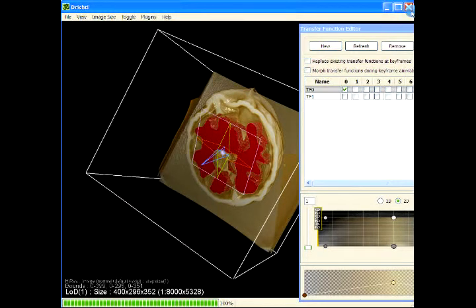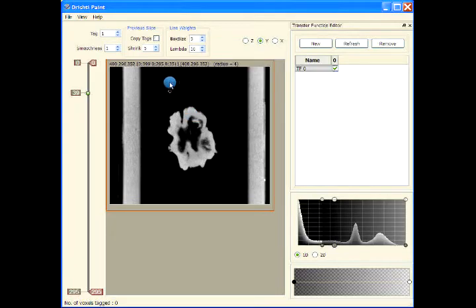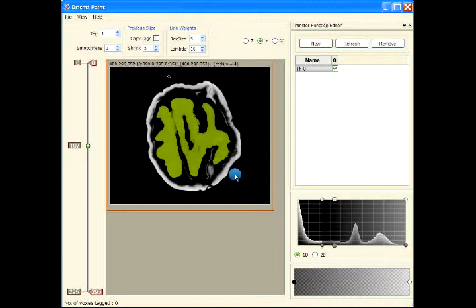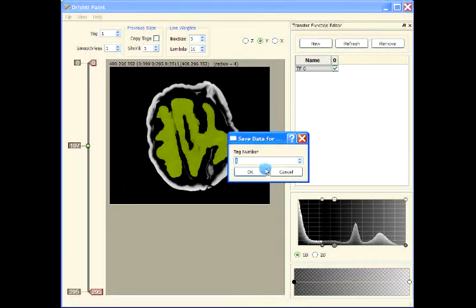What we can also do is, instead of looking at the volume and mask in this way, we can actually just save that portion from the original raw file. So we can extract the tag region, and we are going to extract tag region 1.